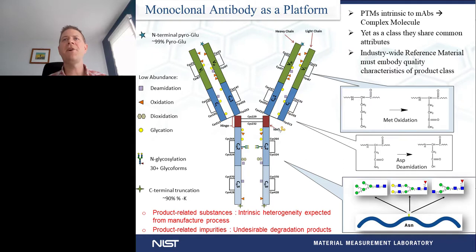So in this case, we started to talk to our small biotech, our large biotech, and our federal collaborators, and we did actually get that message that everyone should be using a common standard. It would be great to have something that was shared, that we could have joint system suitability criteria. And in the bottom here with large biopharma, the more robust these standards are, the better off we'll be when we start to develop attribute-specific monitoring assays, which I'll talk about a little bit later today, that can really look at each of these individual decorations on the monoclonal antibody material in very high specificity.